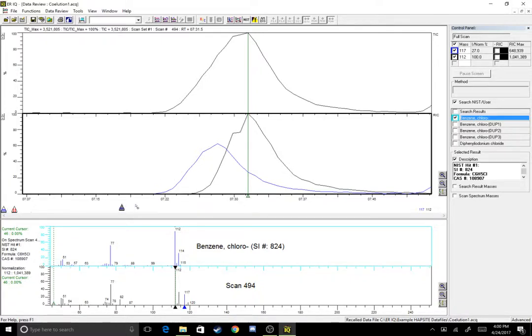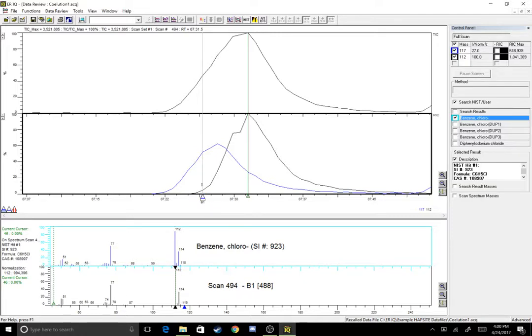So that more or less covers it for how to identify co-elution and then how to get rid of co-elution in ERIQ. Thanks guys.